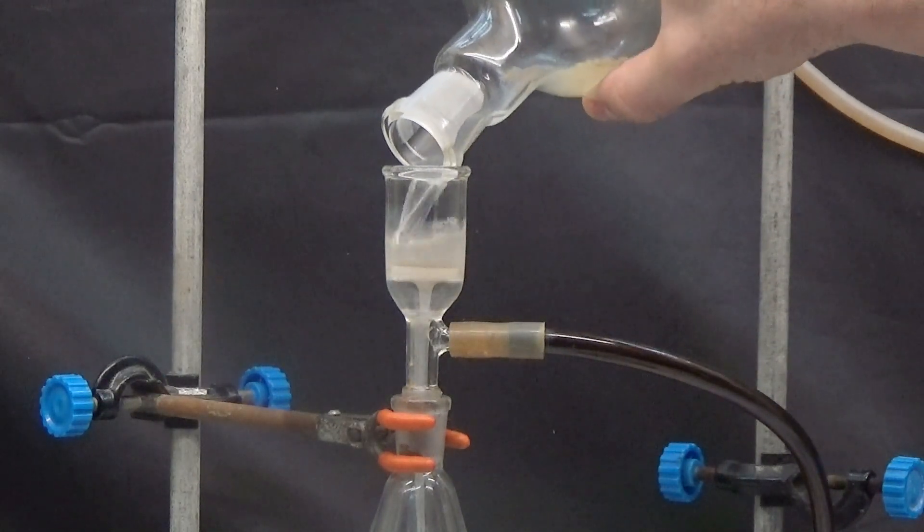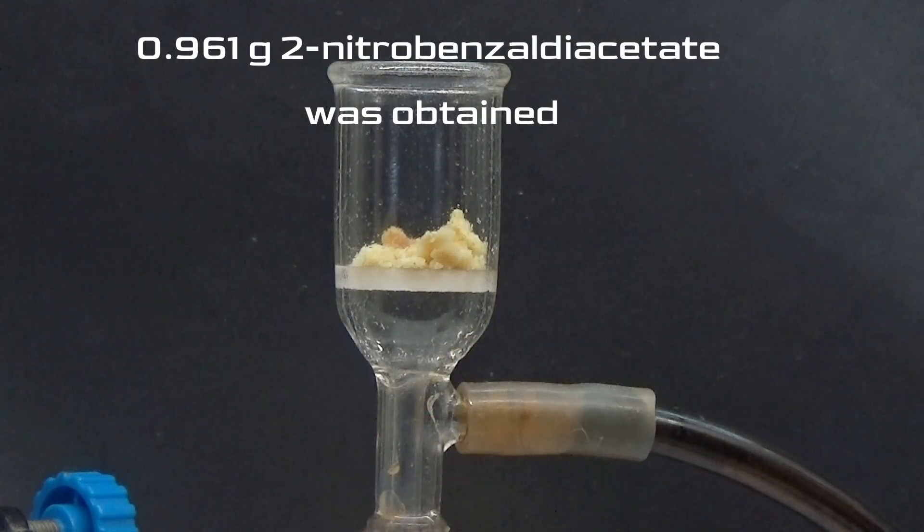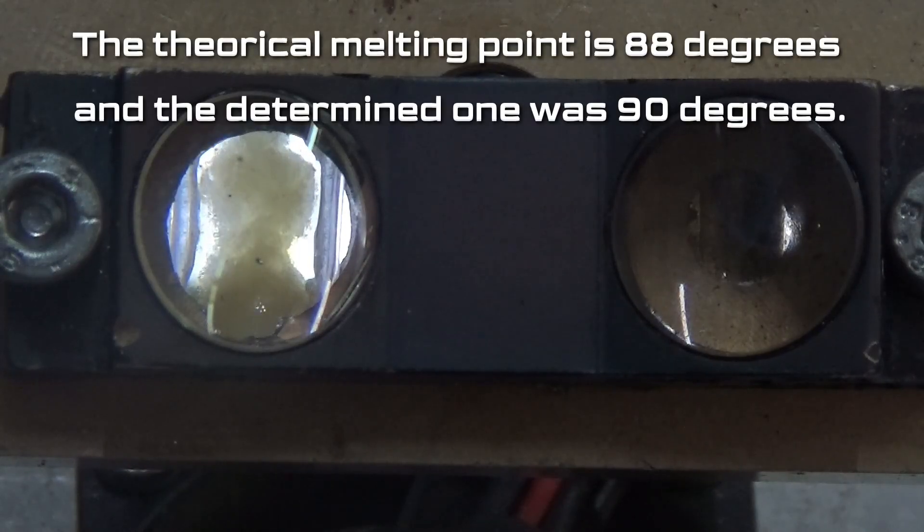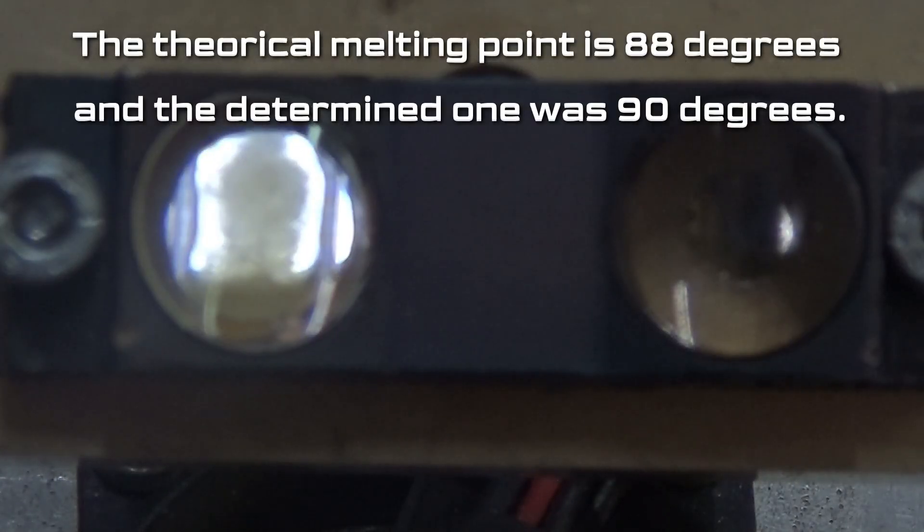From this product 0.961g was obtained, determine the melting point. The actual melting point is 88 degrees and the determined one was 90 degrees.